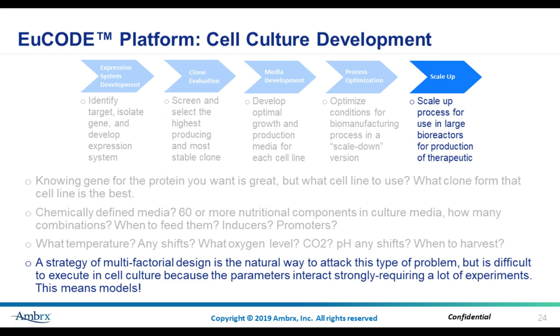Beyond manufacturing support, the scale-down model can also be used for process characterization and validation experiments to study acceptable ranges of process operating parameters and determine the critical operating parameters.